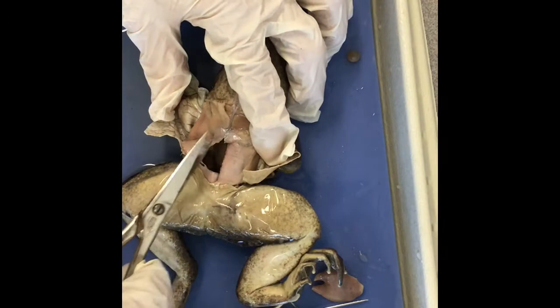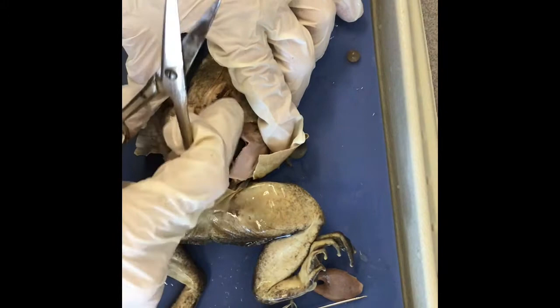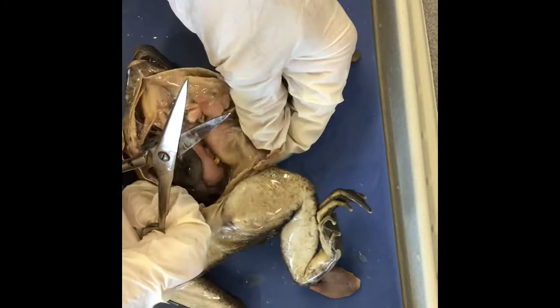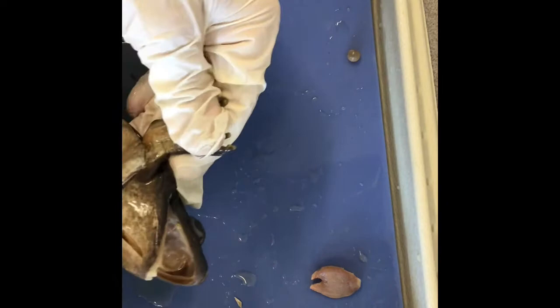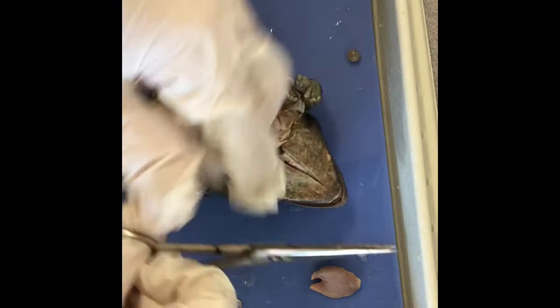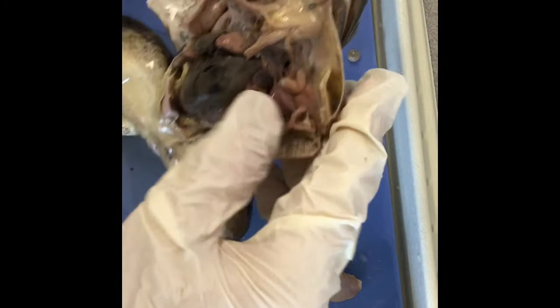This kind of clear connective tissue is called mesentery. I cut open the skin and the muscle layer. Those are the fat bodies.